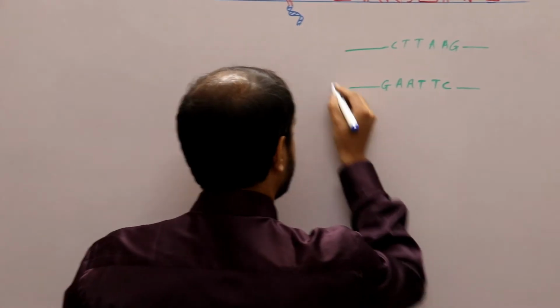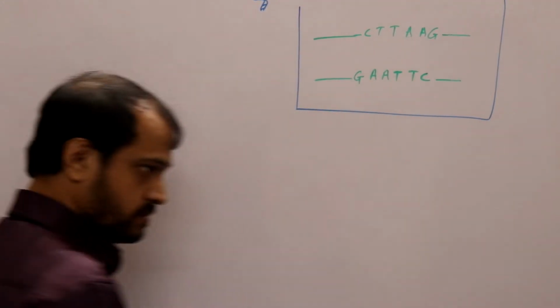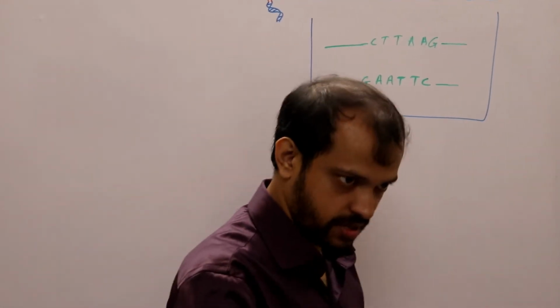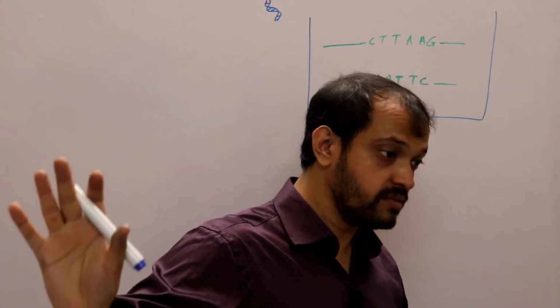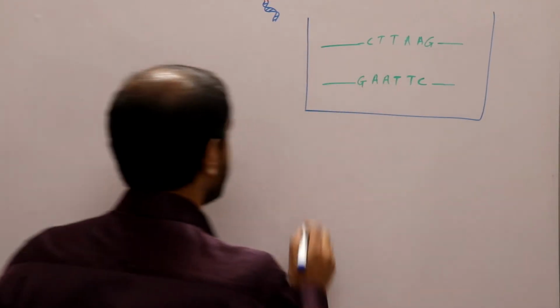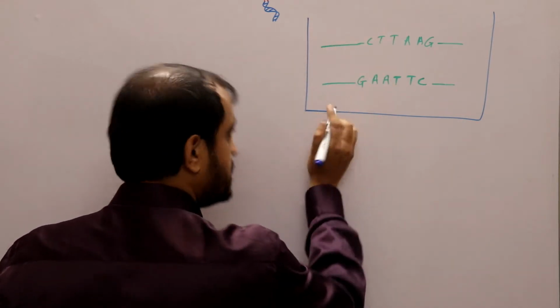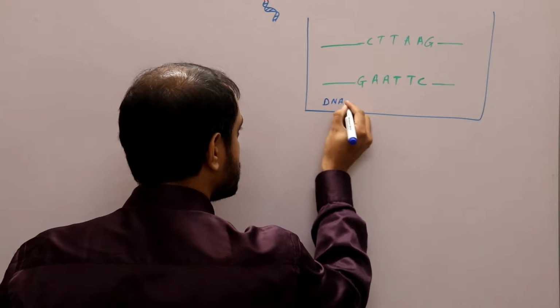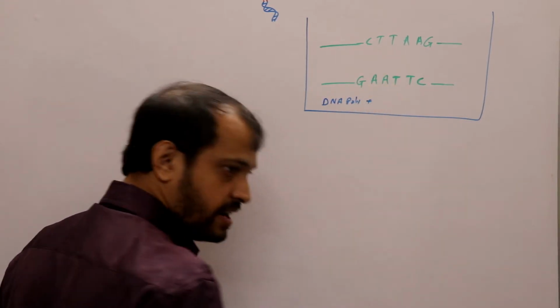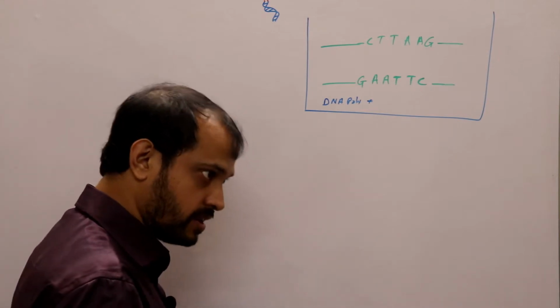Now listen. Suppose you take this whole DNA sequence in a beaker, in a parallel universe. So in the beaker, we will have to add this sequence, then we will have to add DNA polymerase, right? Then we will have to add magnesium sulfate, then we will have to add primers, but only one type, forward or backward.